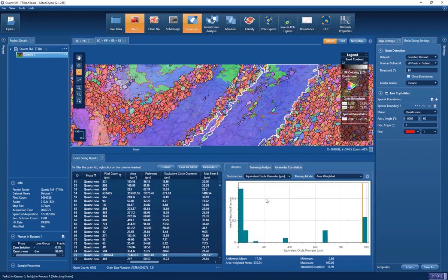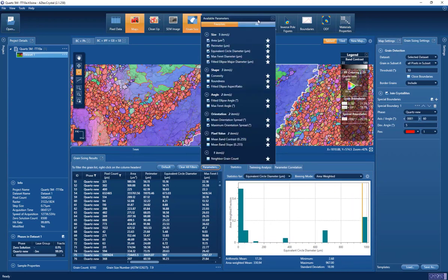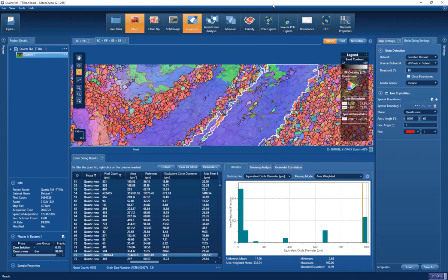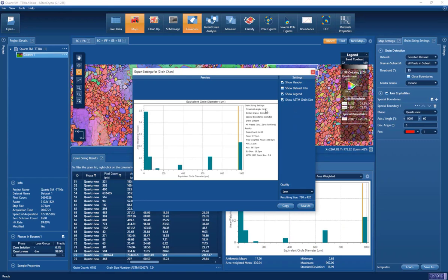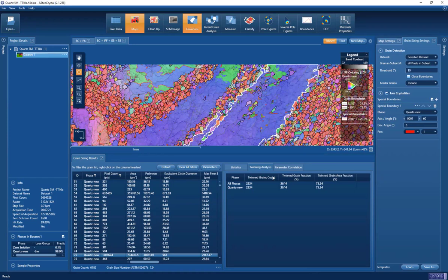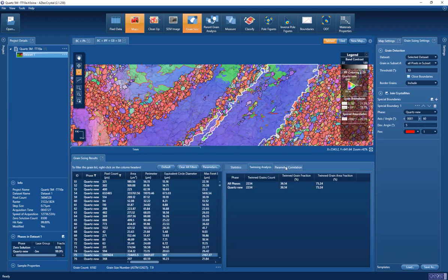We can look at many different parameters — shape, size, orientation, and pattern quality — in our grain detection. We see an arithmetic mean of 17 microns or an area weighted mean of 330 microns, along with the ASTM grain size number, and we can export the histogram with all the relevant information. We can also see how many grains have been twinned: 36% of the grains in this data set have been twinned, constituting 75% of the whole map area, broken down on a phase-by-phase basis.